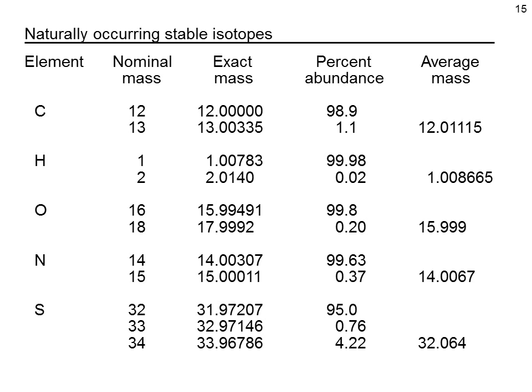I've already referred to isotopes a couple of times, so let's take a look more closely at isotopes with different elements and how they affect the mass spectrum. Which isotopes should we be concerned about? First and foremost we have the carbon isotopes 12 and 13 nominal mass. Especially carbon-13 is very important for mass spectrometry, as it leads to the multiple peaks that we've already seen. Further to this, the presence of carbon-13 in molecules in nature is also very advantageous for interpreting mass spectra, as we will see in a minute.